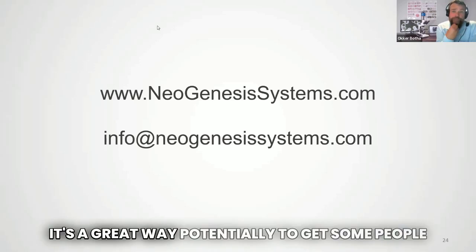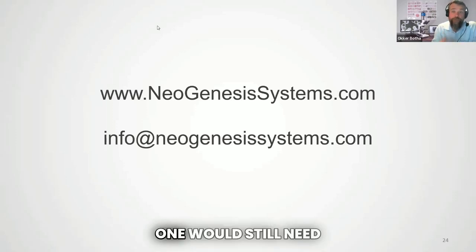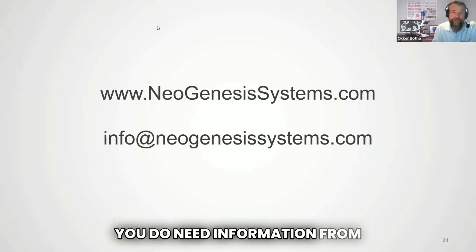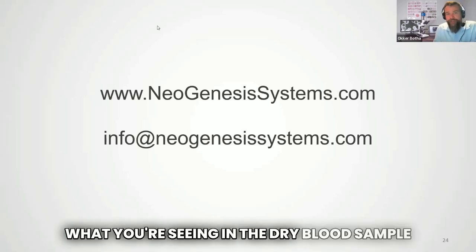It's a great way potentially to get some people into the practice and to get them to become familiar with the technique, but one would still need to get them to come in for more complete analysis thereafter, because you do need the information from the live sample to tie in with what you're seeing in the dry blood sample.